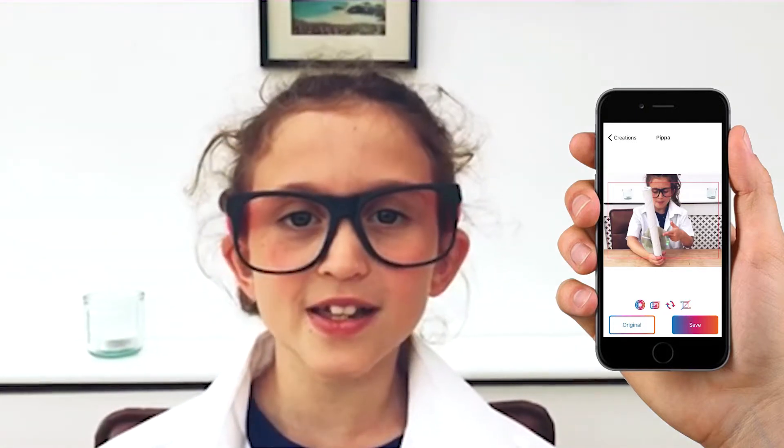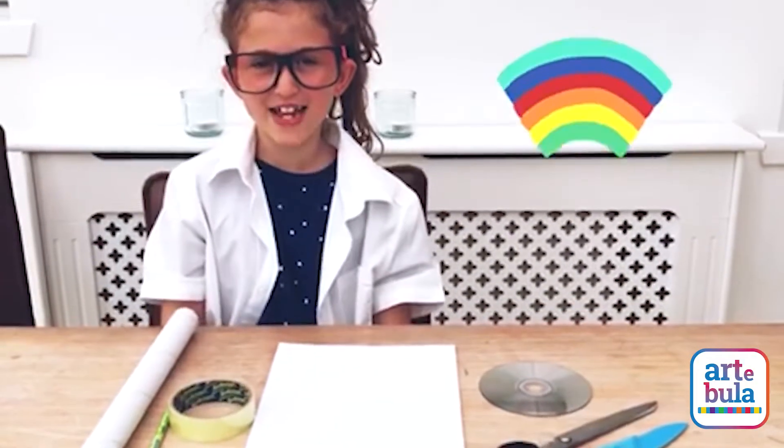Welcome back to our fabulous little makers. Today we're making a homemade spectroscope. This makes rainbows using light reflection.